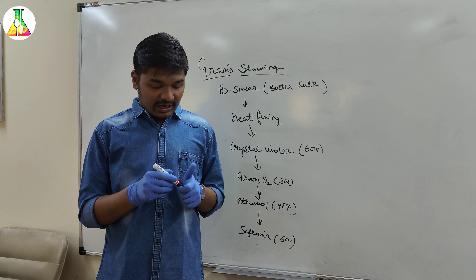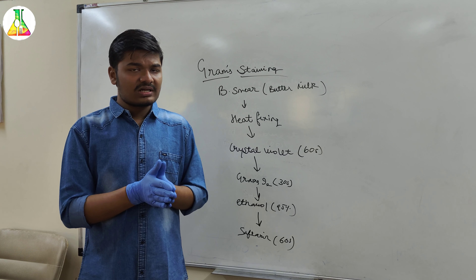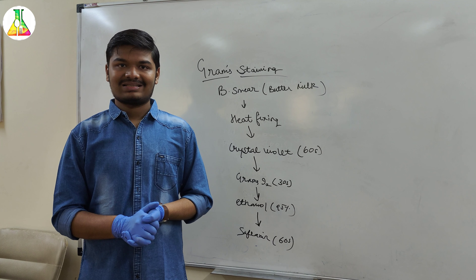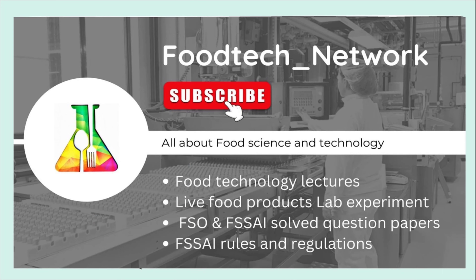And now we begin our microscopic examination. I have taken this light and this is our microscope. We will switch it on and put on the lights to give bright field. Now using the slide adjuster we will adjust our slide. We have different magnifications, so we will begin with the 4x — that is 4 times magnification. By coarse adjustment and fine adjustment we will first see where our stain is, and then zoom in. Similarly we can do it at different magnification levels. You can see the microscopic view of the slide on your screen.